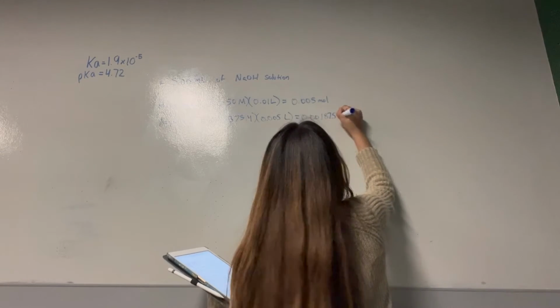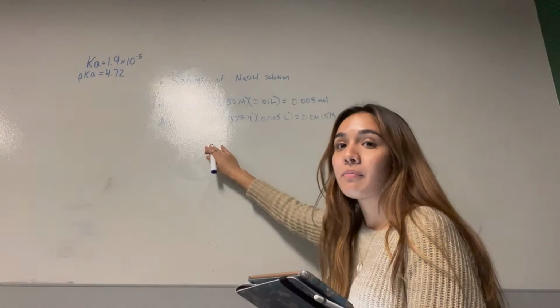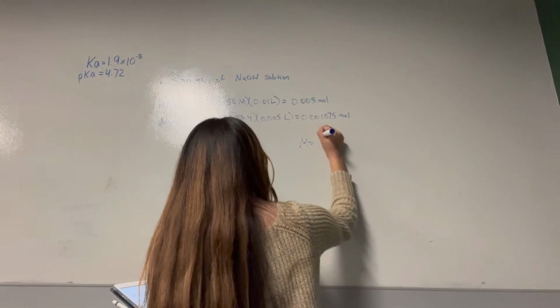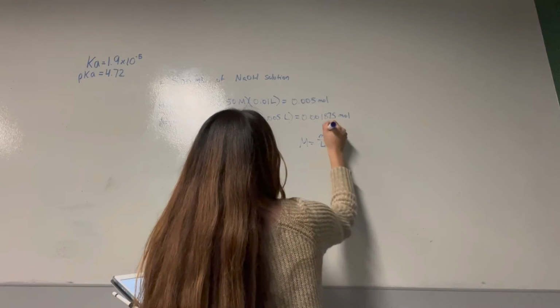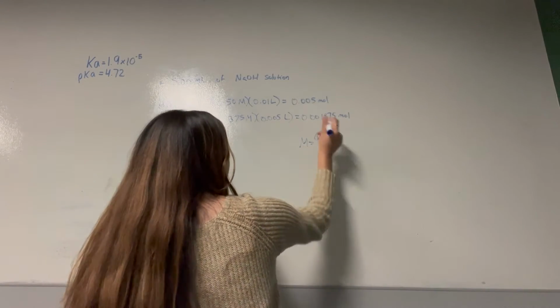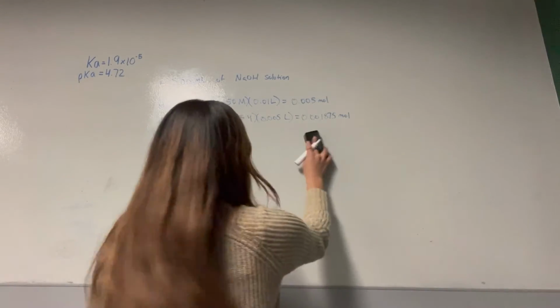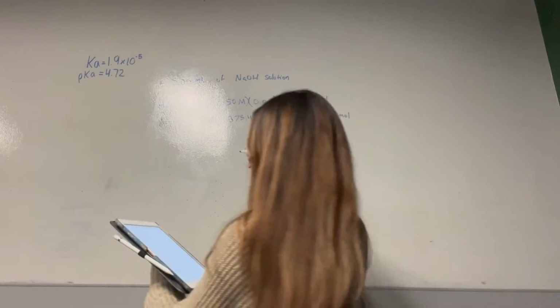Upon doing this calculation, we find that we have 0.001875 moles of NaOH. And to clarify why this calculation works, it's because molarity equals moles over liter. Therefore, to obtain moles, you can multiply molarity by liters to obtain this amount due to this equation.